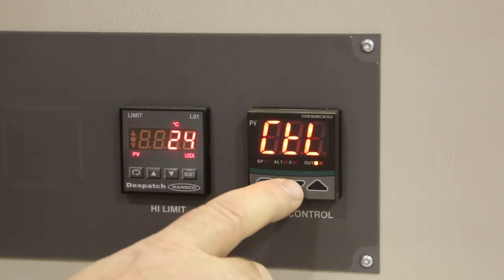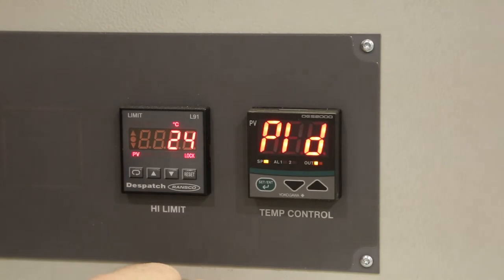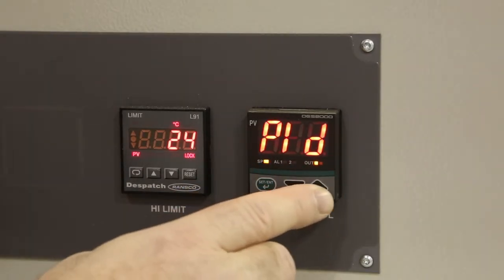Press the down arrow once and ensure that PID is displayed. If it is not displayed, change it to PID using the up or down arrows.